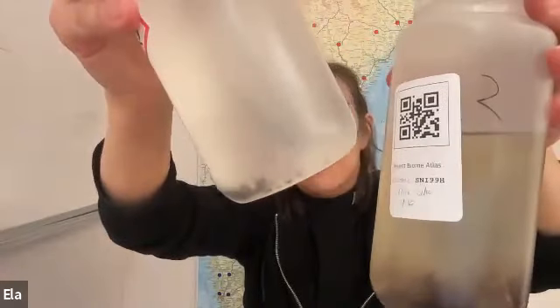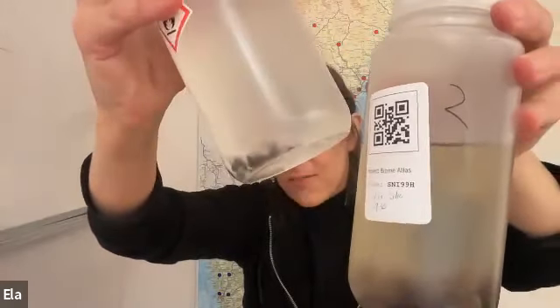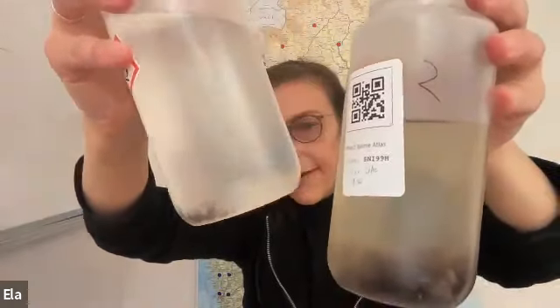So yes, I brought two examples of samples. Some samples are big, much bigger than this one, actually. And some are this small, just a few insects inside, or even smaller, of course, because we also sample in winter in Sweden. So some samples are really tiny. If you would add the same amount of buffer to those two samples, this would be very diluted DNA, and then you would not recover the biodiversity that you're aiming for. So it's crucial. Many crucial steps.